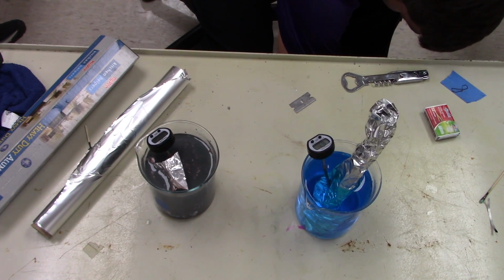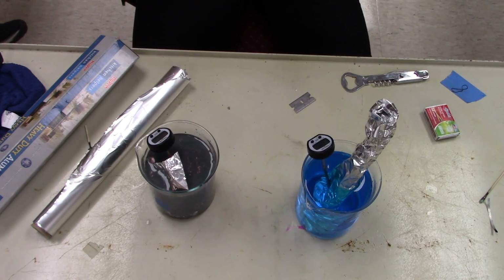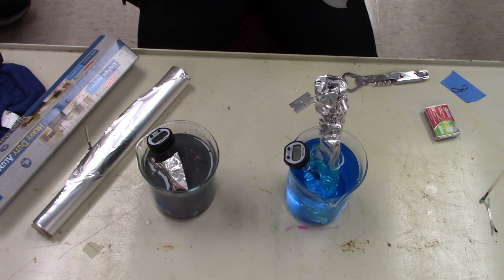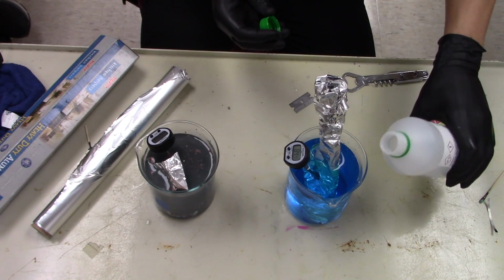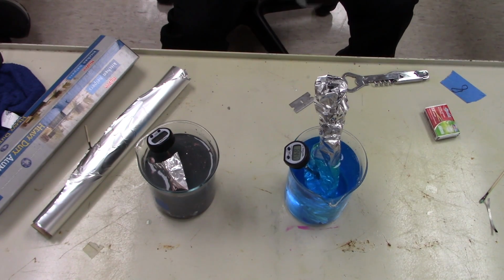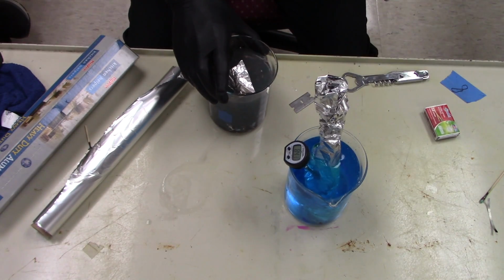Now, this is eventually going to turn into that, but that's no good. So what I want to do is speed it up. And I can speed it up by adding what's called a catalyst to it. Our bodies make these catalysts, and we call them enzymes. But you can make a catalyst for just about anything. So I'll dump in some hydrochloric acid. And very soon here, this should start fizzing and getting pretty reactive.